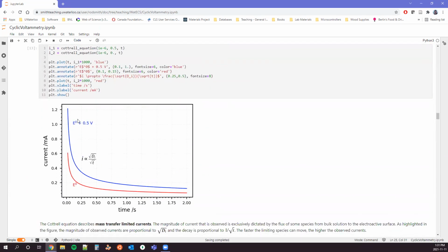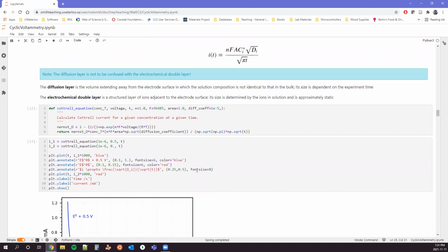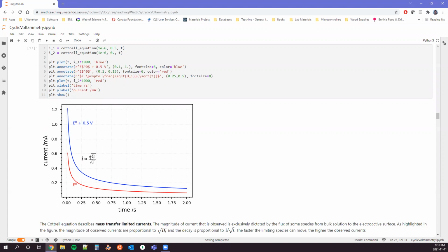And so when we go to a large overpotential, we see large currents, right? We're doing a larger change. We're going from 0% to 100%. Whereas when we're stepping to our formal potential or our standard potential, what we have is a step from 0 to 50%, right? And so we see that scale, which is what we expect to see in the equation here. And so what we see in both of these is still this decay, right? And so our decay is going to be proportional to the root of our diffusion coefficient divided by the root of our time, right? And so we see kind of the same structure in all of them.